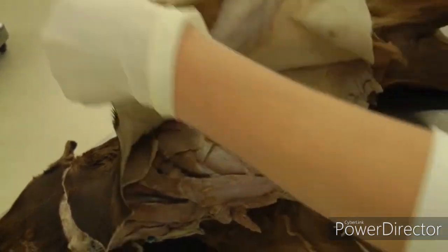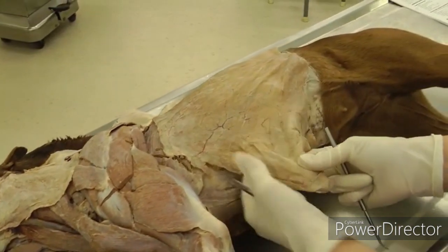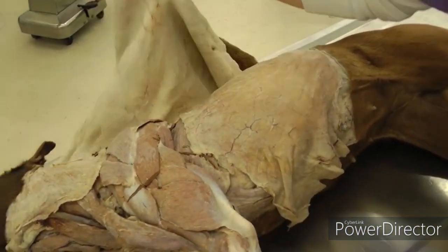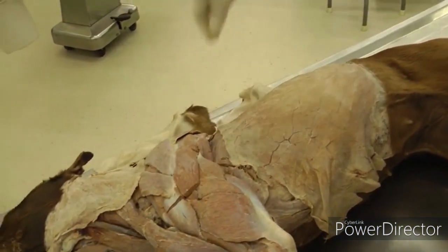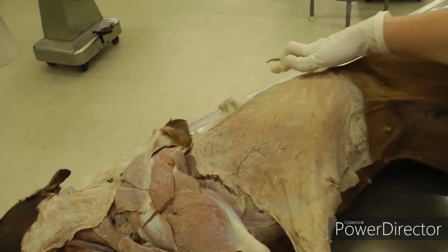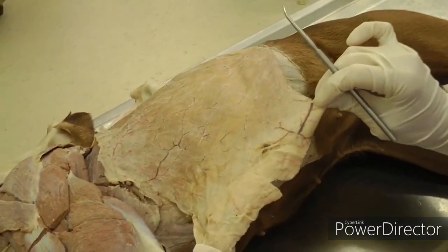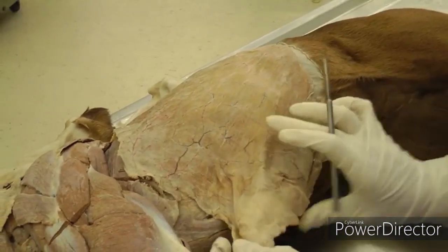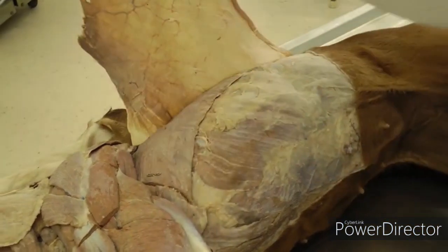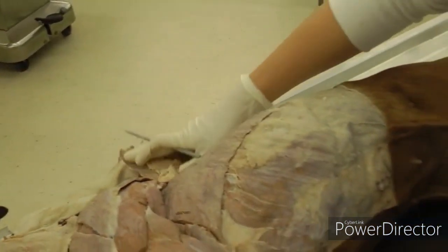When you reflect the skin, try to leave the cutaneous muscles on if possible — if not, that's okay. You'll see them on the skin when you pull it off. This is the cutaneous trunchi, which covers most of the thorax and abdomen. You're going to cut on the midline and reflect that up as a sheet of muscle — very thin like a sheet of paper — and flip that up.